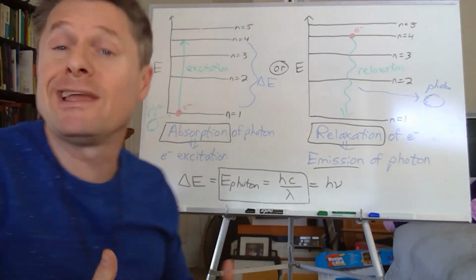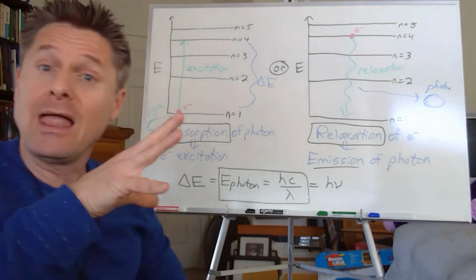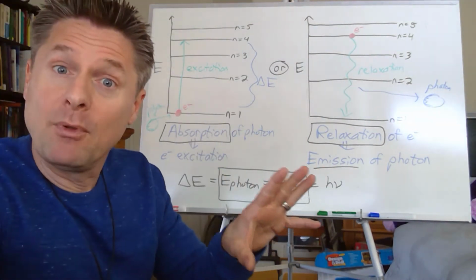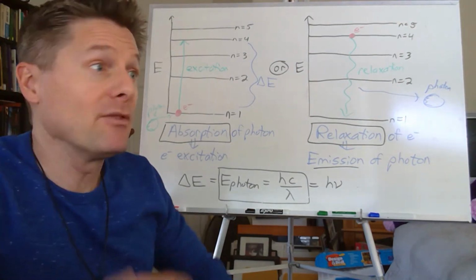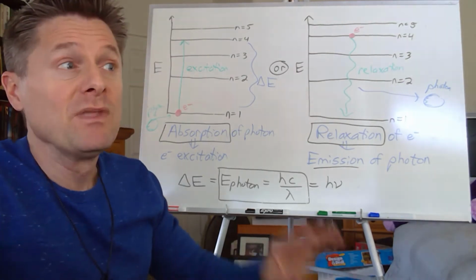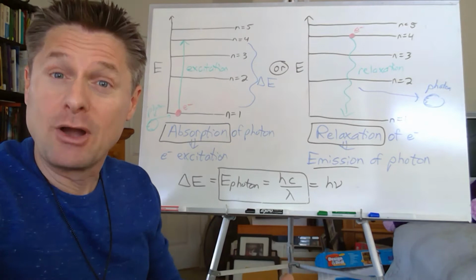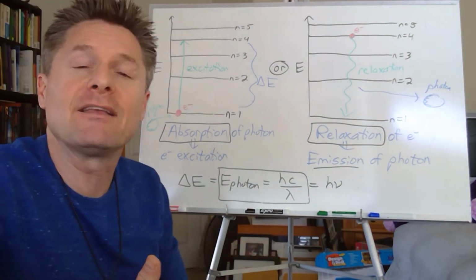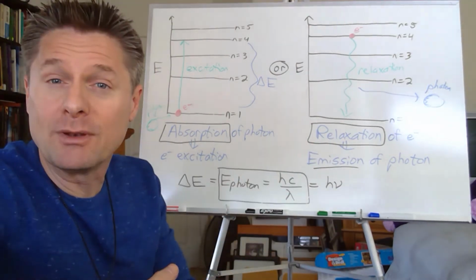And that's why particular solutions have particular colors, right? So I can take white light of all different wavelengths of the visible region, strike a sample, and maybe just a few of those wavelengths, maybe in the bluish region, or maybe in the yellow region, or the reddish region get absorbed. Everything else goes through, and we see what gets through. We see the complementary color. So it's kind of cool. So you can almost estimate what wavelengths a particular species will absorb based on the color that you can observe of a solution.